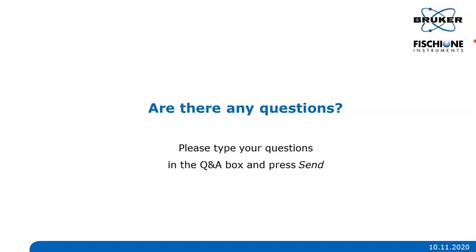We have one question. Do you have any recommendation for additively manufactured 4340 material, BMD process? I believe I'm having an issue with carbides coming out and scratching the surface while mechanically finishing the sample. Yes, of course, the solution will be argon ion milling with a shallow angle, 2-3 degrees, and you will get beautiful results.